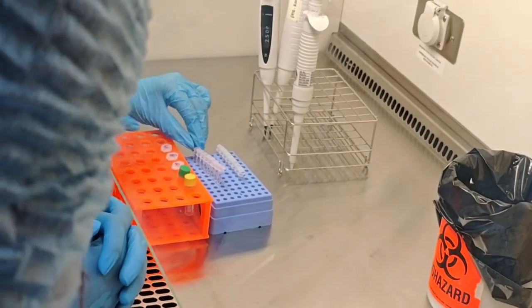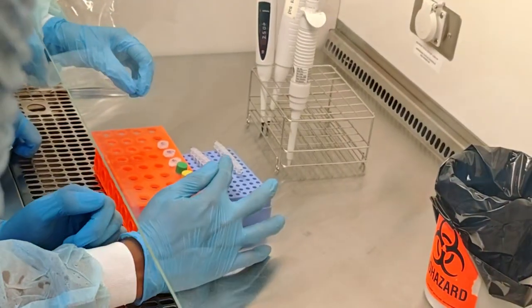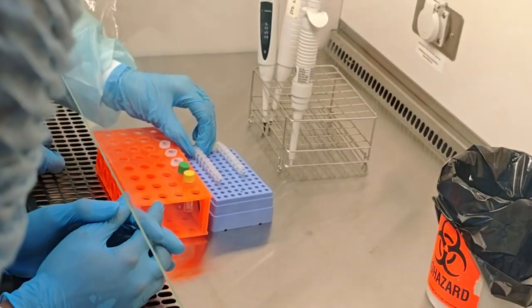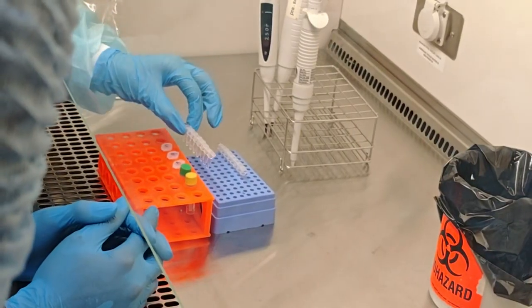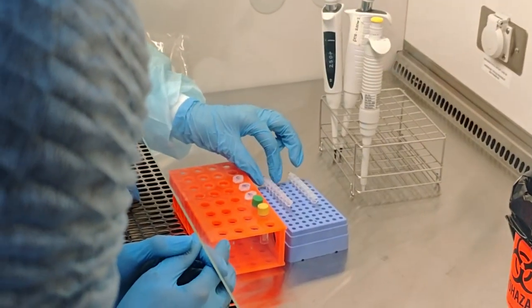You can here? Yeah, you can. But it depends on your instrument. Some of the fluorescent instruments collect the fluorescent from here, some of them from here, some of them from here. So it depends on which kind of instrument you use.